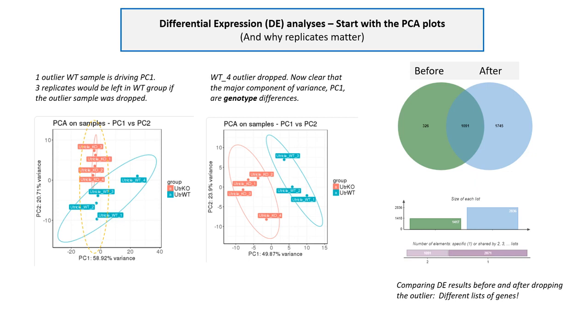There is a wealth of variation between the large data sets for each of your samples. Some of the variation is technical, introduced during sample handling or library construction. Some is stochastic or random, and some is individual variation irrelevant to the hypothesis you're testing. But hopefully, some is biological variation relevant to the hypothesis. A PC analysis attempts to parse the variation into recognizable components. One can then try to correlate known attributes about the libraries to those major components.